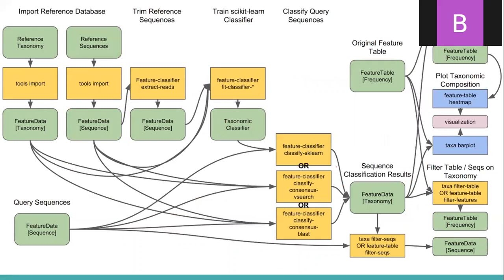Here we can see the pipeline of the taxonomic assignment. There are lots of alternatives, as you can see, but we use this one, sklearn, and we will right now use our classifier and feature data to obtain the taxonomy assigned sequence variant results.